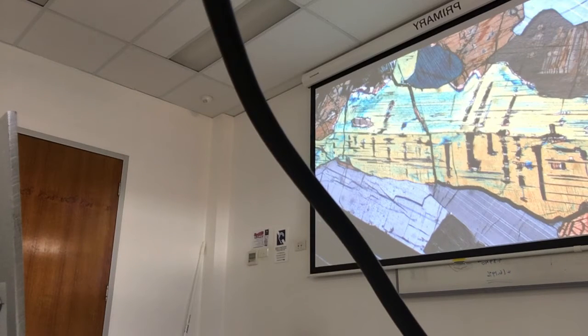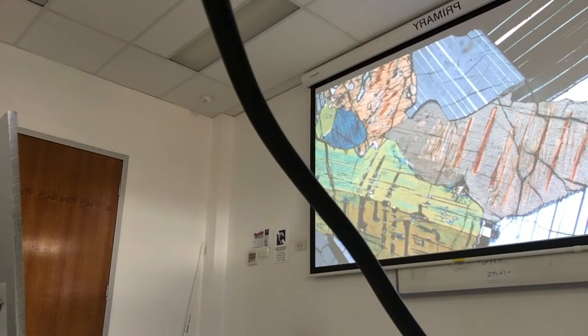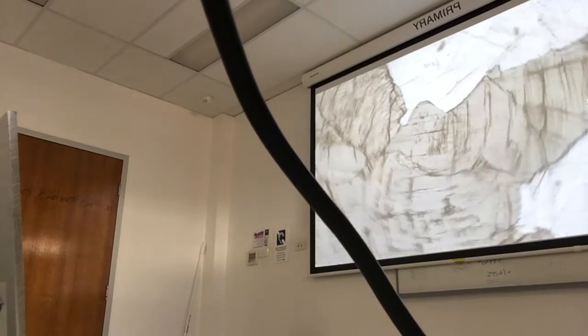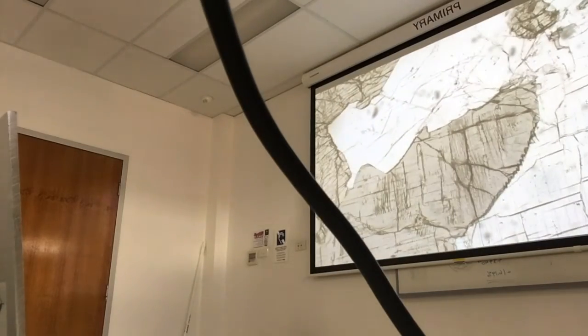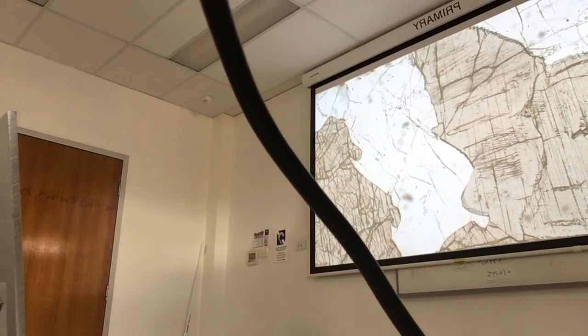Now, if you look around at the orthopyroxenes in this slide, there's one right there. Let me just check the pleochroism on that. Oh, actually, you can see the pleochroism much more obviously in this one. Notice again, the host there is not changing.